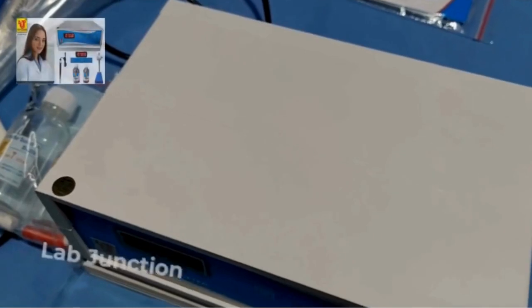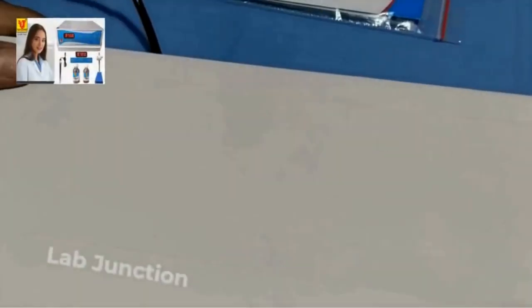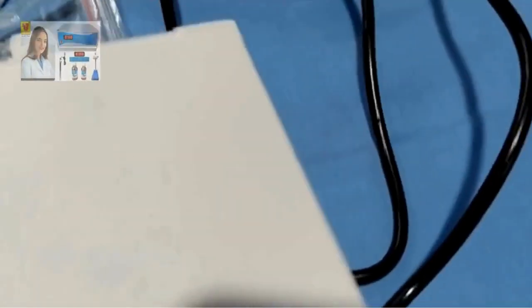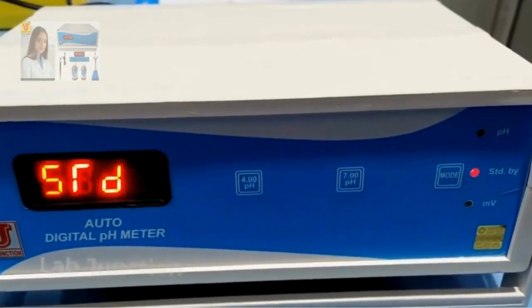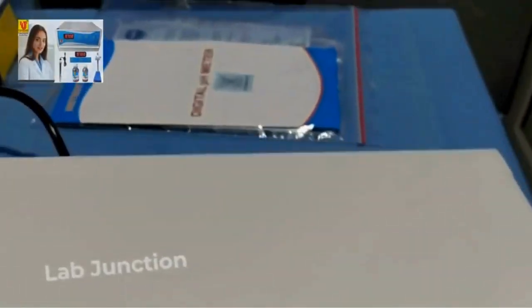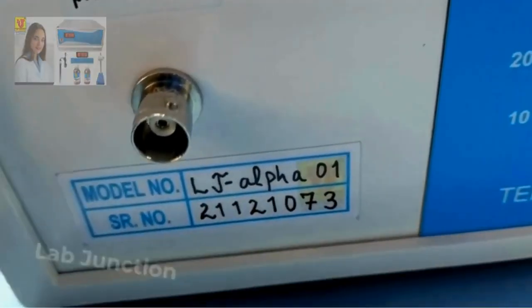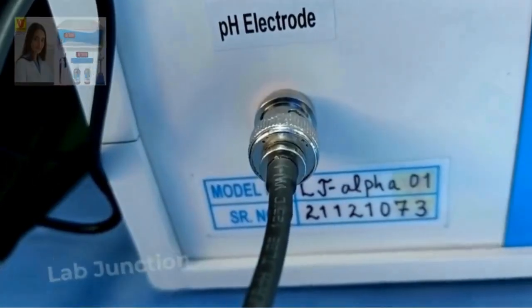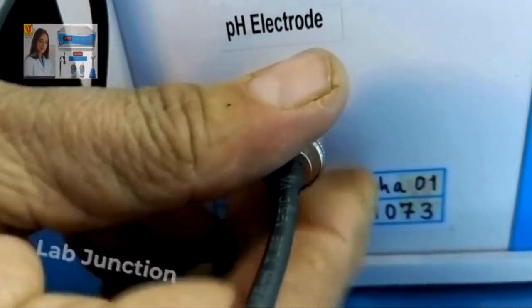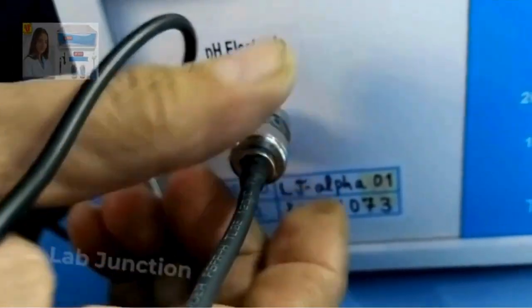Now, how to calibrate this instrument. First, I have switched it on from the back side of the instrument. The display starts. Now I am connecting the epoxy body pH combination electrode to the instrument — just push and twist to lock it in place.